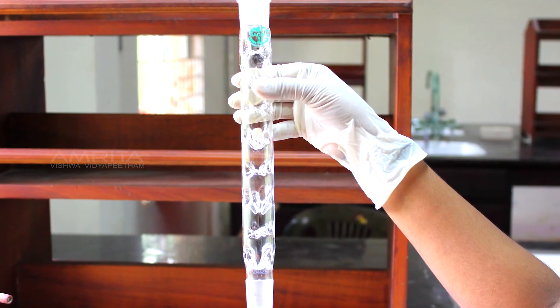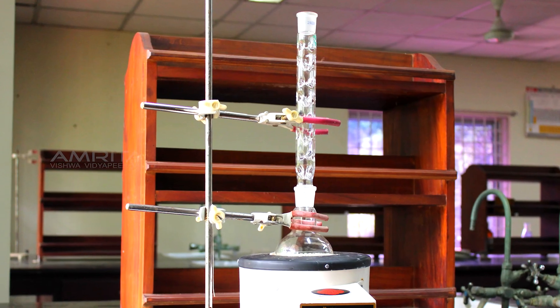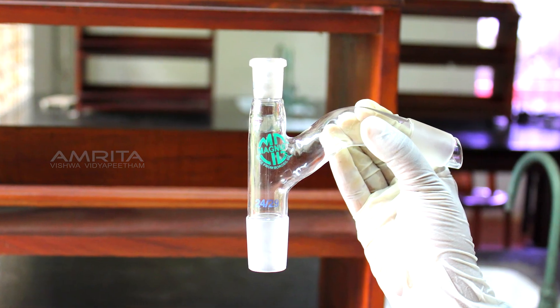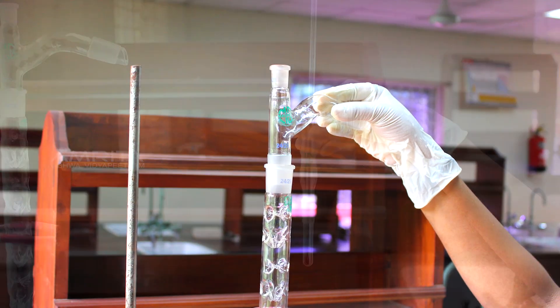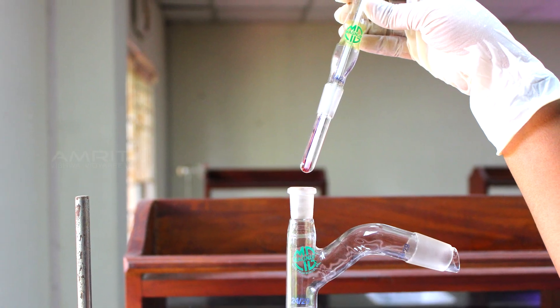Now, connect a fractionating column to the RB flask and clamp it. Connect a distilling head to the fractionating column and a thermometer adapter containing thermometer to the distilling head.